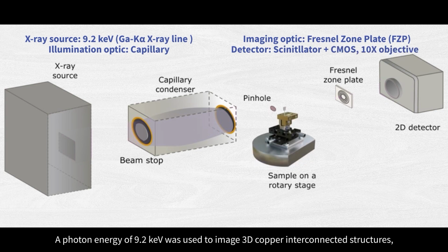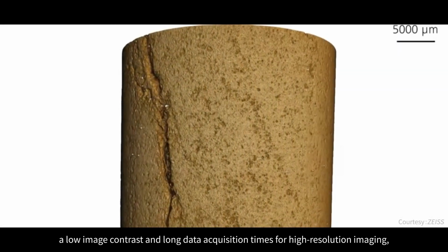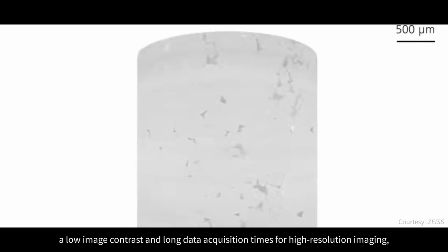A photon energy of 9.2 keV was used to image 3D copper interconnected structures, and it was demonstrated that the limitations for high-resolution X-ray imaging, that is, a low image contrast and long data acquisition times for high-resolution imaging, can be mitigated. Siemens star test pattern images.